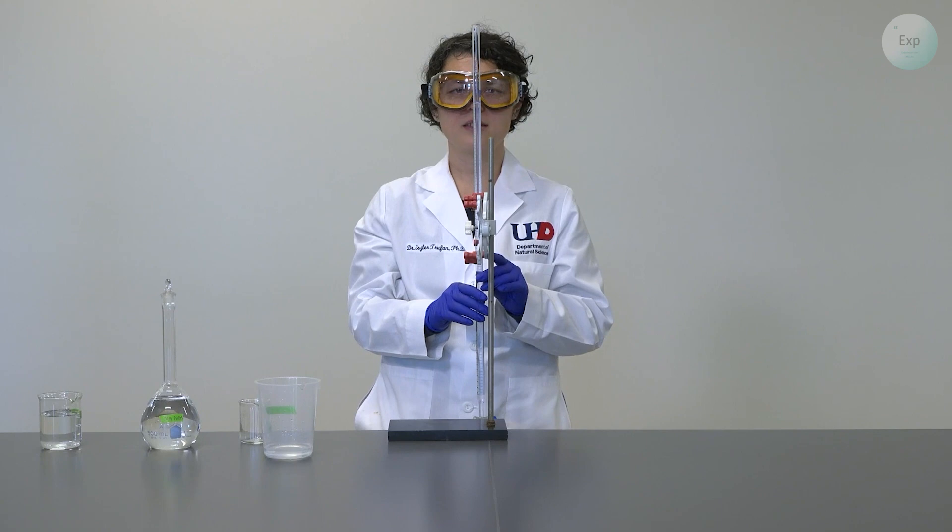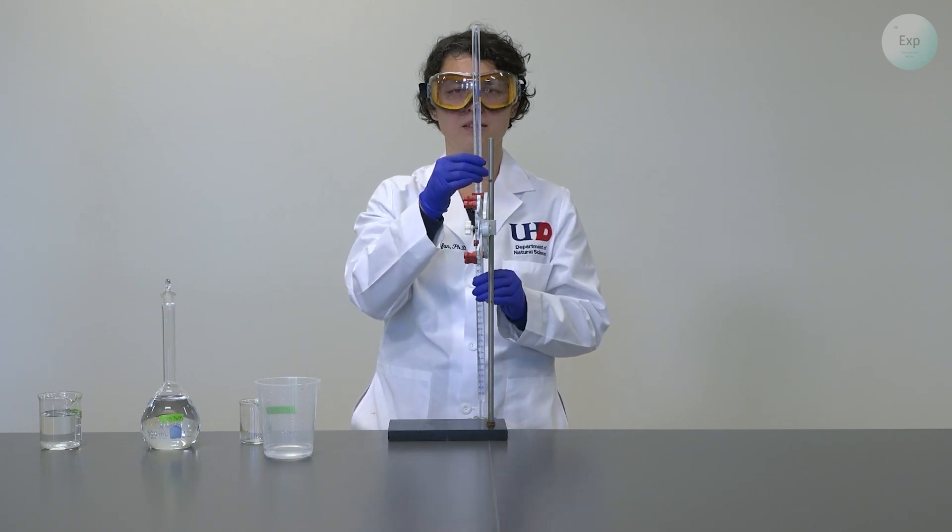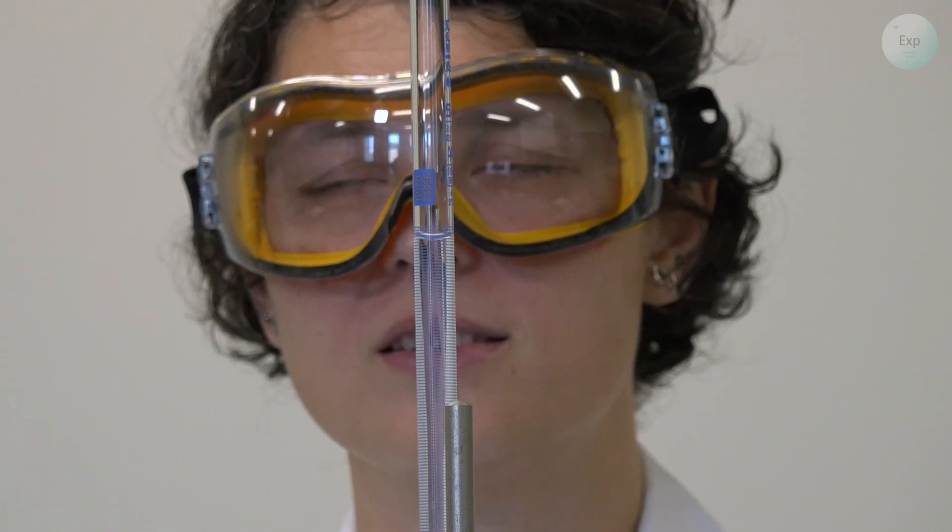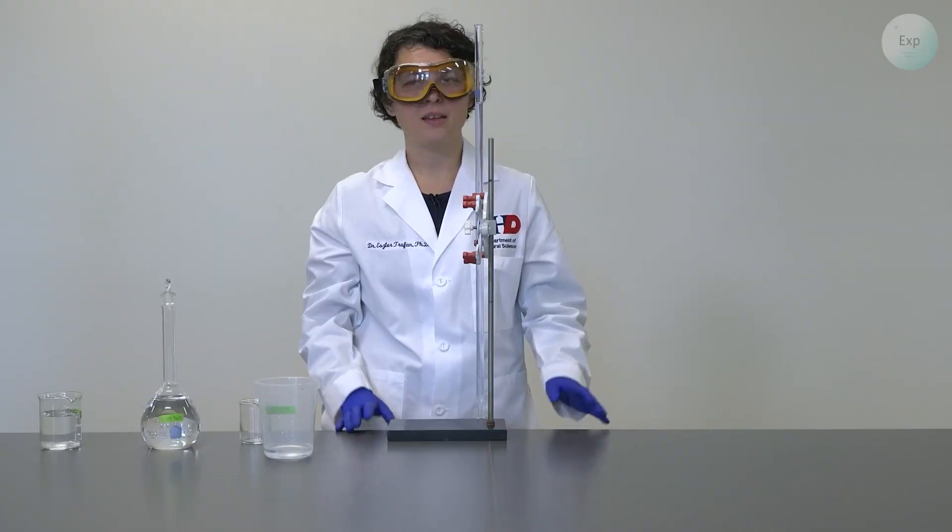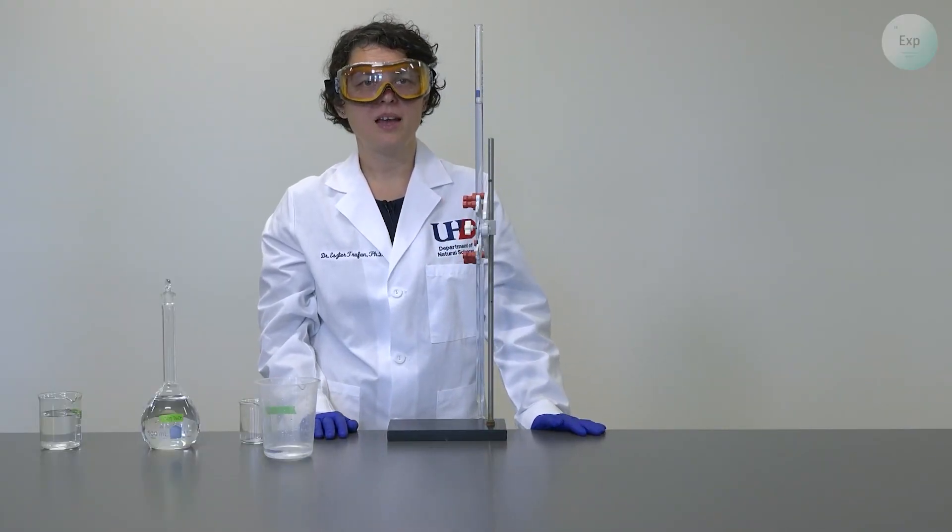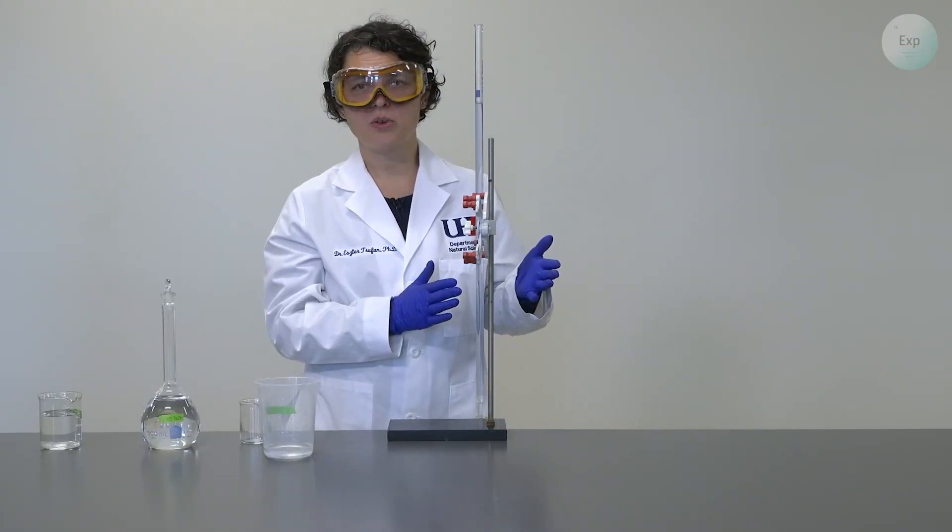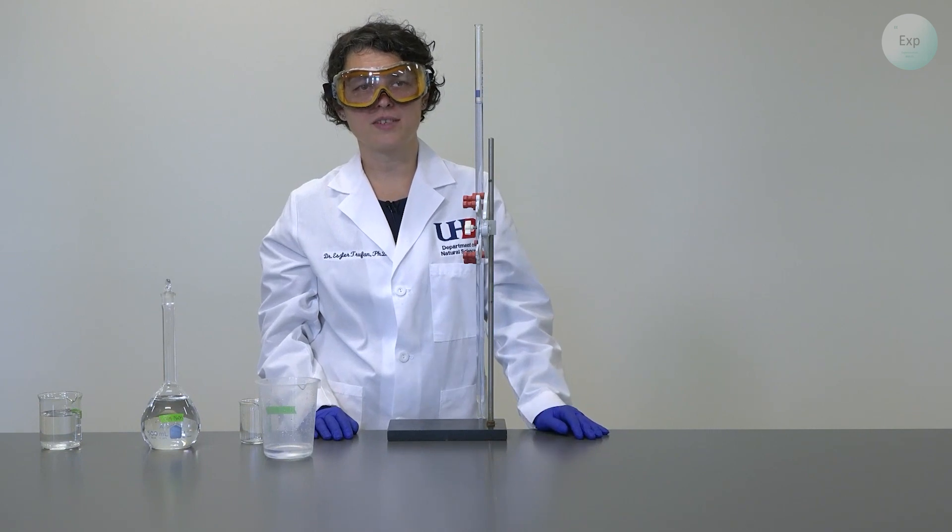In our case, the number is between 0.3 and 0.4, and it's closer to the 0.4, so it will be 0.39. That is our starting volume. And with that, we have a charged burette that is ready for its first titration.